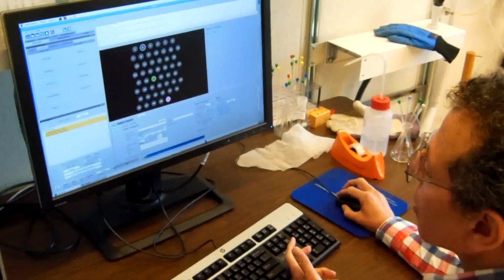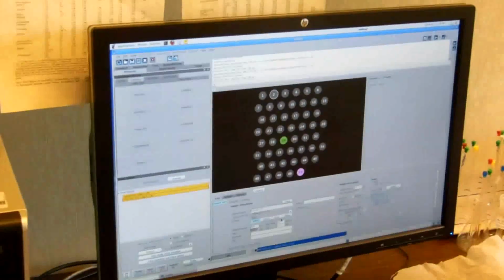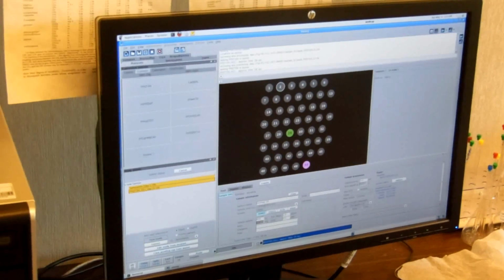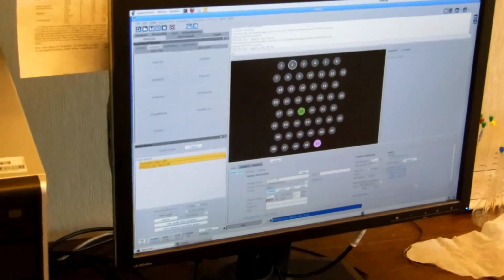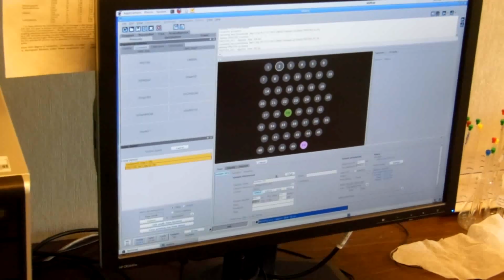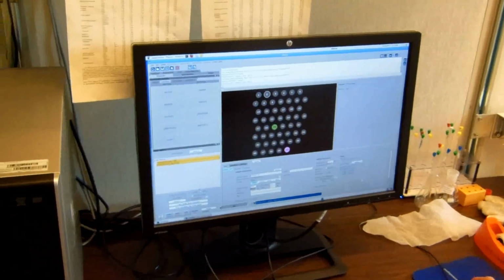Then you come here to the other parameters, what kind of solvent, DMSO, then you write the name of the sample, so I write Hisham 1R. Now everything is fine: the solvent, the name of the sample, and the number of scans. It means the sample is ready to be submitted to the machine. It is in number 2, you can see here, then I say submit.